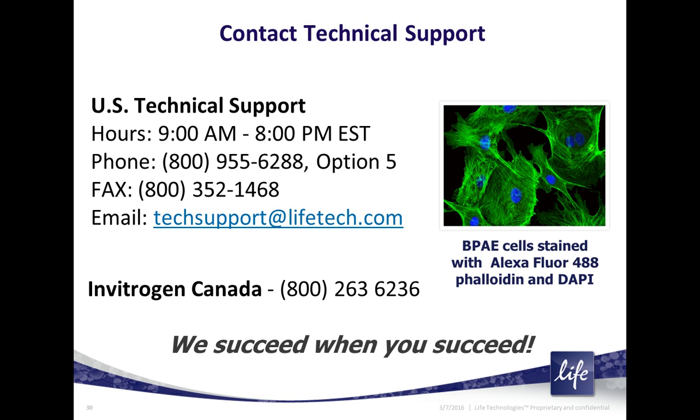Okay, so going back through some of the earlier questions here. Evans Blue for counterstains. If I'm correct, Evans Blue is a chromogenic dye. That is, it's a non-fluorescent dye. I didn't address chromogenic dyes that you would use with transmitted light to image. Most often, chromogenic dyes will actually quench fluorescent dyes, so you don't typically want to use chromogenic and fluorescent dyes together. Now, there are some exceptions, but for the most part, that remains true.